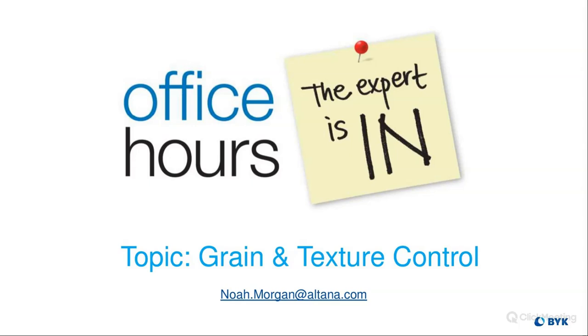Right. So something important to note is that the fine algorithm is really meant for those really small micro textures. Normally we record the whole value, but in the fine algorithm, it uses micro. You'll see the micro symbol in front of all the values, so it's making sure that everything's super small. When you look at your amplitude, you're no longer looking at the full cell amplitude, but now you're looking at the micro cell amplitude. So it changes that.